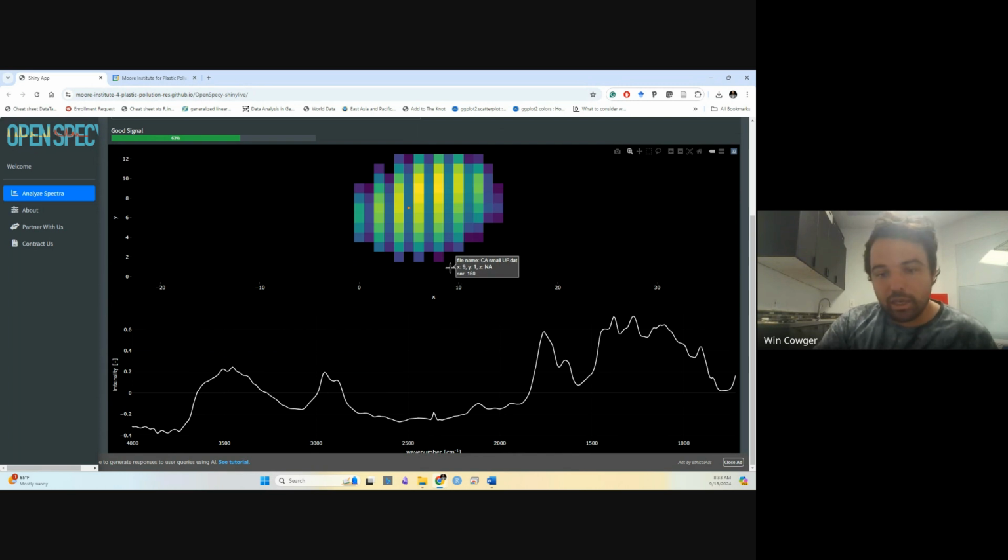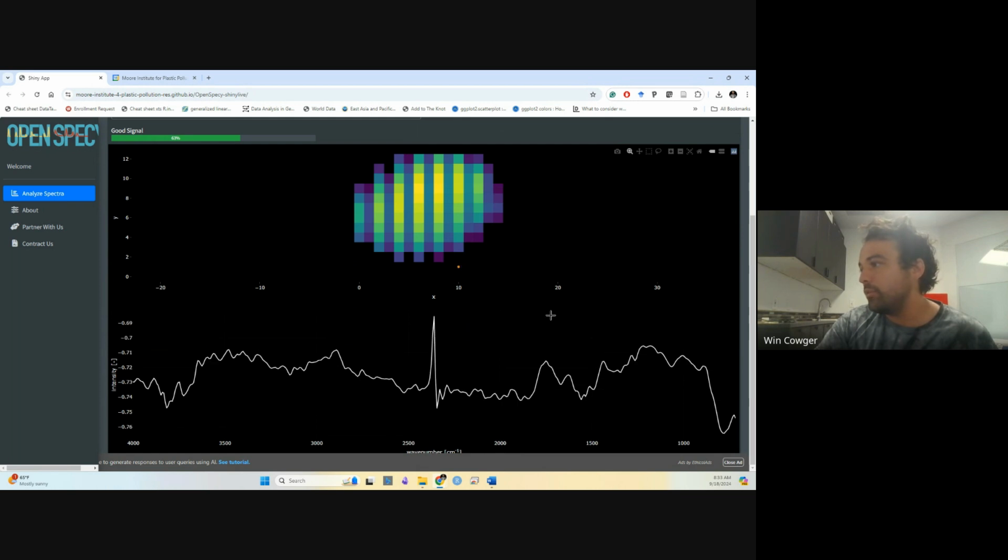In reality, it's more complicated than that because, for example, in these spectra, we have these high peaks that are due to CO2 influence. The CO2 influence creates this high peak, but it's actually an artifact that we're not interested in. And so you can have a high signal to noise ratio on this spectrum because of an artifact. So that's one thing to think about.